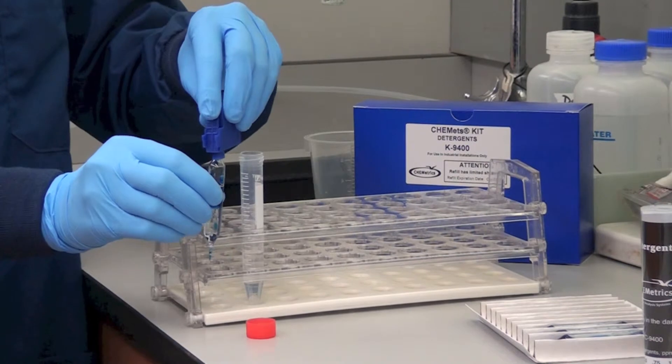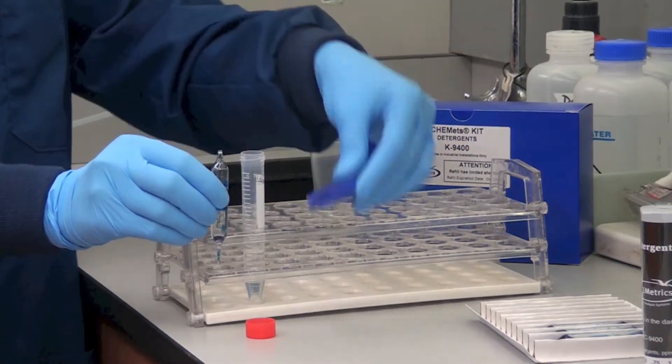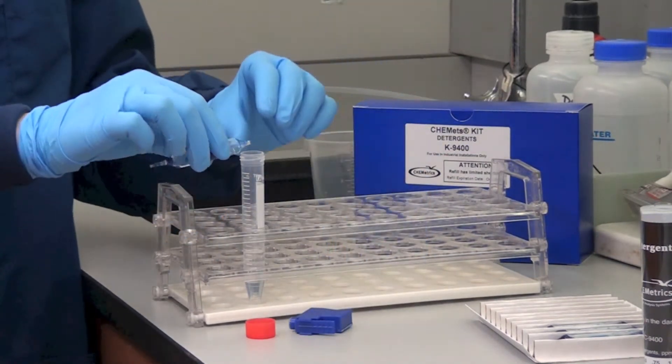By holding the double tipped ampule in a vertical position, snap the upper tip using the tip breaking tool.